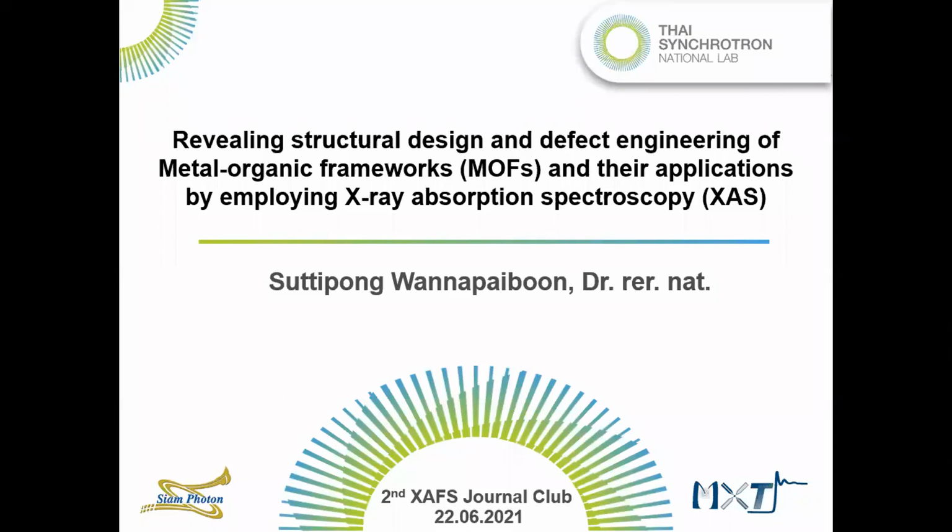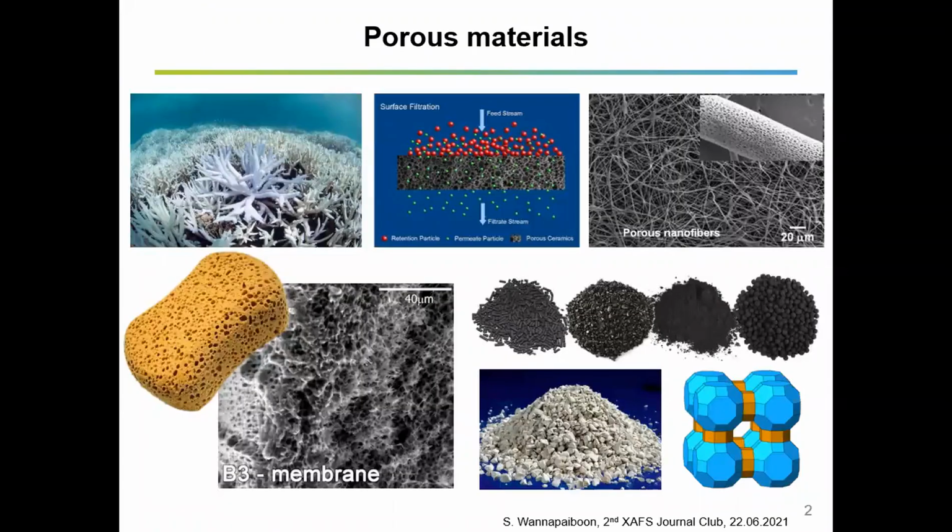So we use X-ray absorption spectroscopy techniques in metal-organic frameworks as well. But before I go into the details of what we use XAS for in MOF, I firstly would like to introduce a little bit in general what exactly MOF is. So we're starting with porous materials.